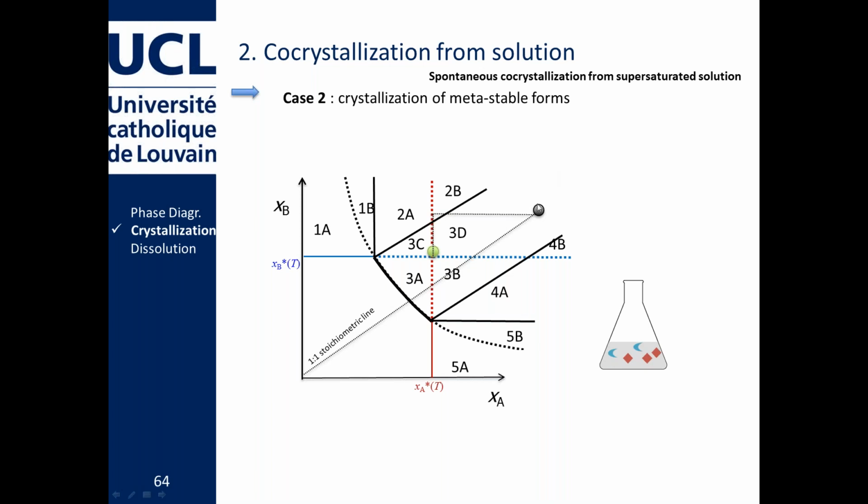So even now, if the co-crystal should exist, I ended up with a suspension which contains caffeine and maleic acid. My solution is still supersaturated with respect to co-crystal, so it can at a certain moment appear. I become undersaturated with respect to caffeine and maleic acid because my co-crystal suddenly crystallized. So they both dissolve and my co-crystal continues to grow.